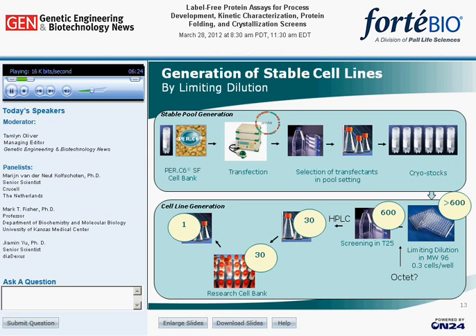In this slide, an overview is shown of the general outline of the generation of a stable cell line, starting with the transfection of PER.C6 cells under serum-free conditions. Crucial for this process is a limiting dilution step in which more than 600 wells are seeded, 96 wells, after which the 600 wells will, with cell growth, need to be expanded to a larger T25 format to measure IgG production.